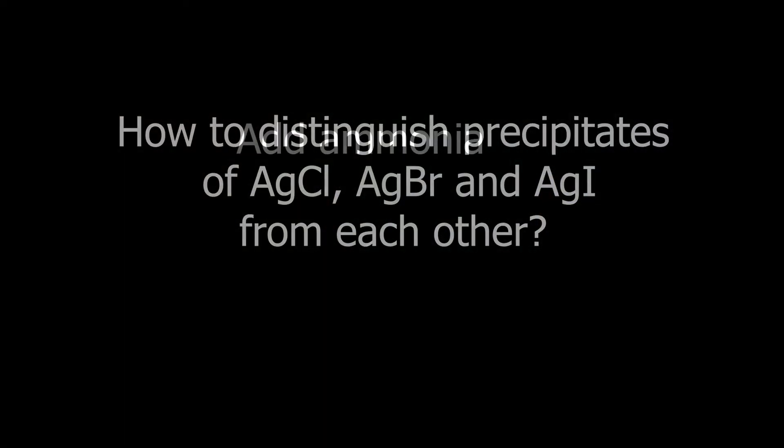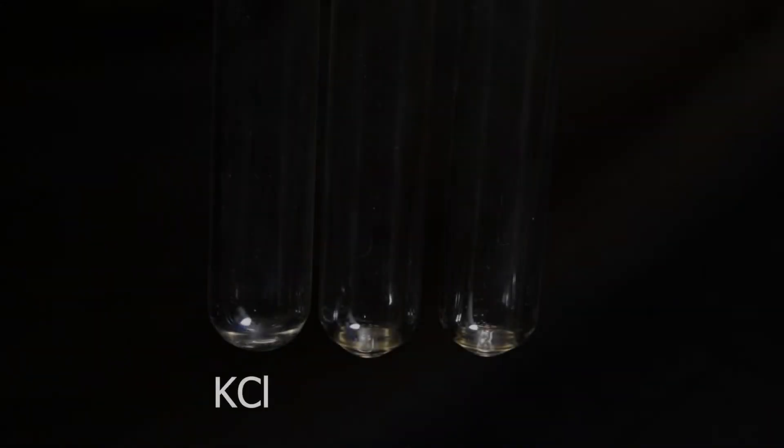We add ammonia. The colors of silver halides intensify down the group, and solubility of silver halides in ammonia decrease down the group.